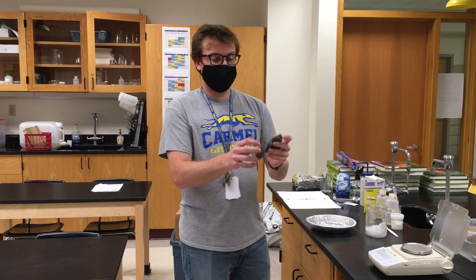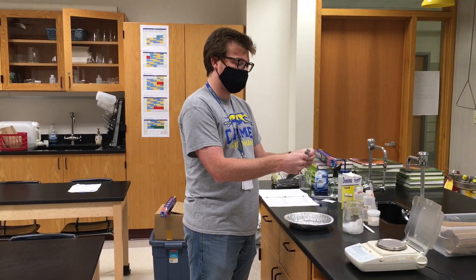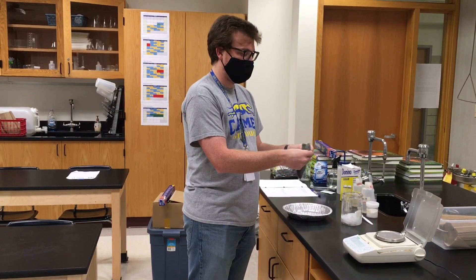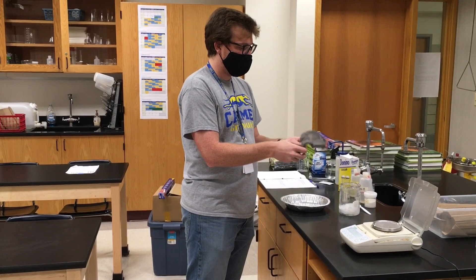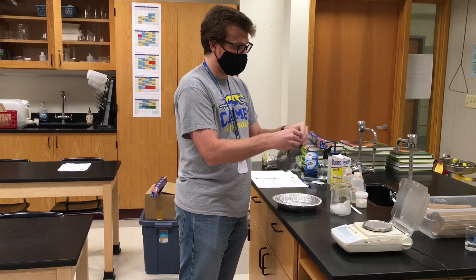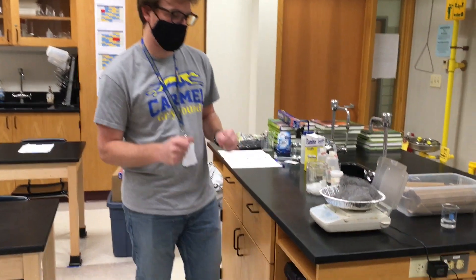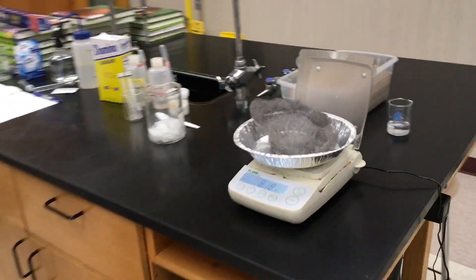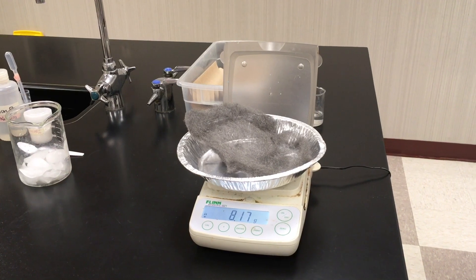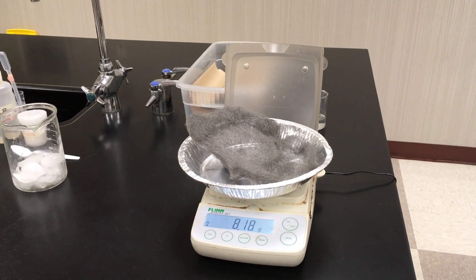Now for the second part of this lab, we're going to grab our steel wool and we are just going to spread it apart. I'm not going to try to rip it — I just want to spread it out so that it is occupying more space. Once I have it all nice and spread out like this, I'm going to put it back in my dish and we're going to find the mass again. It is fluctuating around and we get right about 8.18 grams.